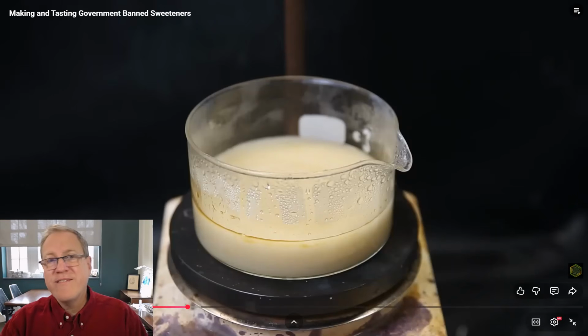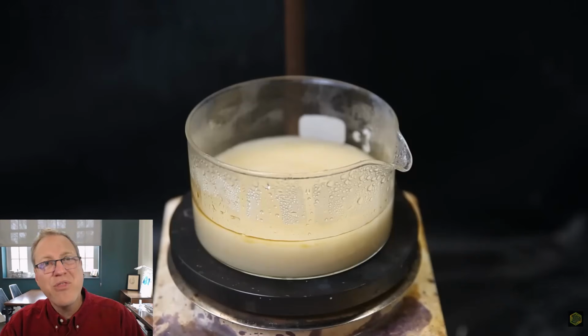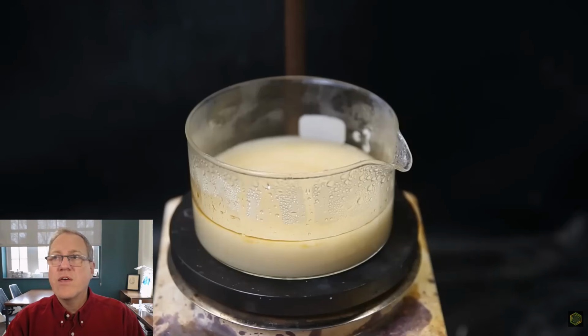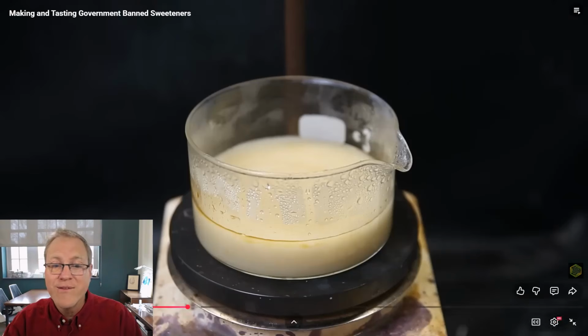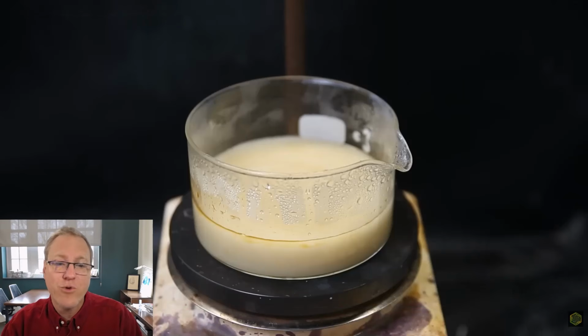Okay, so he says this is milky, which makes me think that there's no solid in there. This is a really common thing in recrystallizations from ethanol-water mixtures, that instead of precipitating out as a solid, things tend to oil out. And so milky implies these are just fine oil droplets in here. Now, that's not a terrible thing, but he doesn't want this to be an oil. He wants it to be a solid because he's going to end up filtering it. So he's going to have to try to get this to solidify, and you'll see it happens pretty quickly.